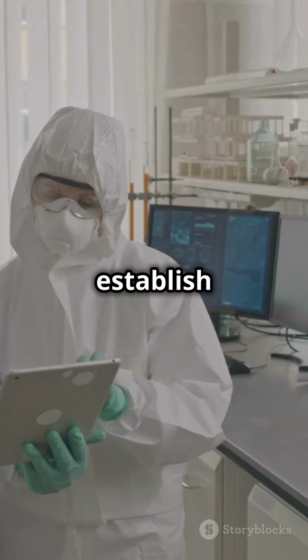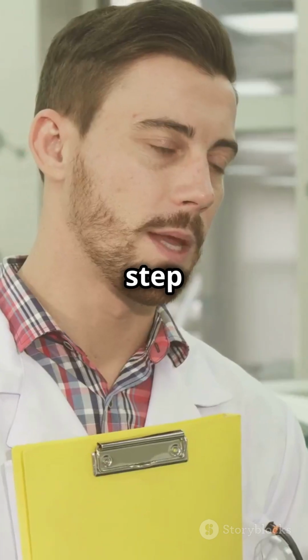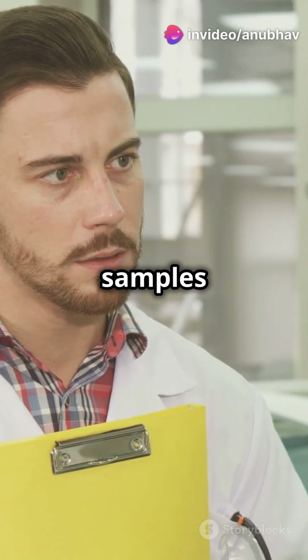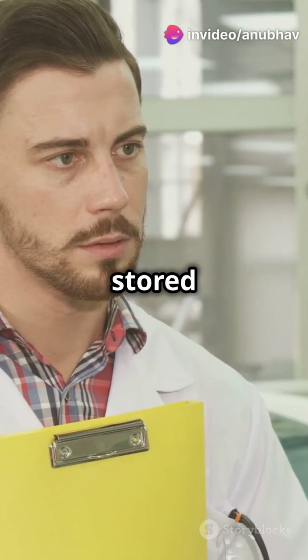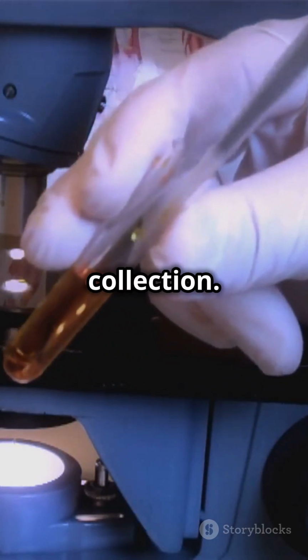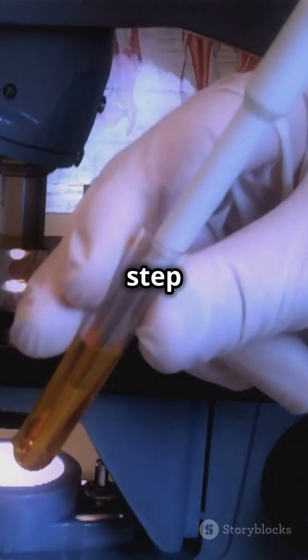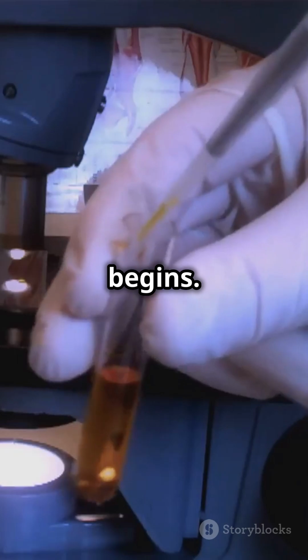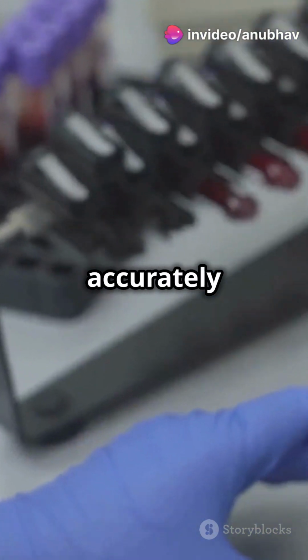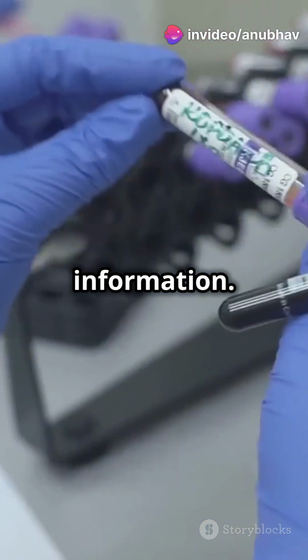Next, establish clear procedures for each step of the process. This includes everything from how samples are collected to how they are stored and analysed. Start from sample collection. This is the first step where the chain of custody begins. Ensure that every sample is labelled accurately with all necessary information.